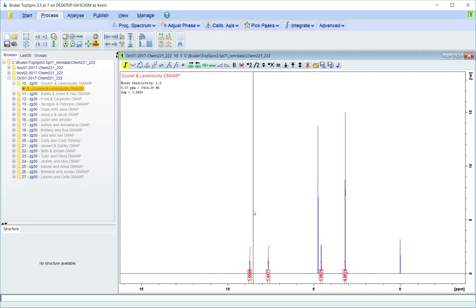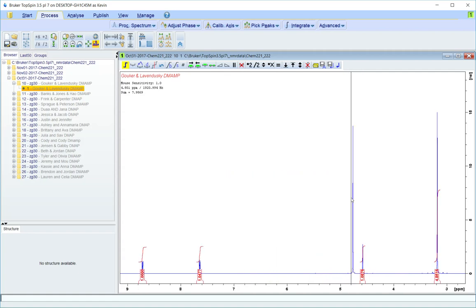So that comes with practice, but you can also kind of rationalize your way through it. Especially since you probably have some idea about what product you're trying to make. So if this happens to be off by a little bit, you can rationalize, oh, there's a little peak underneath there or something, or maybe some of these other peaks have impurity peaks that are throwing their ratios off. It can still come up with a decent structure.